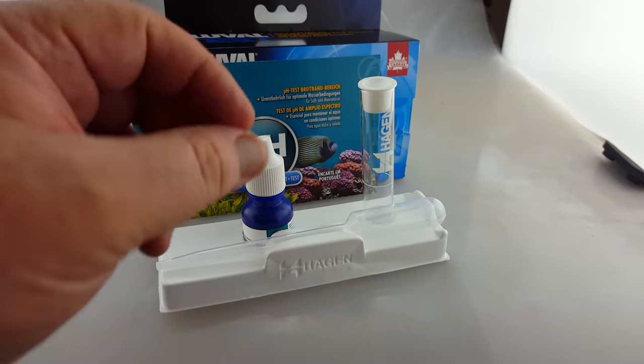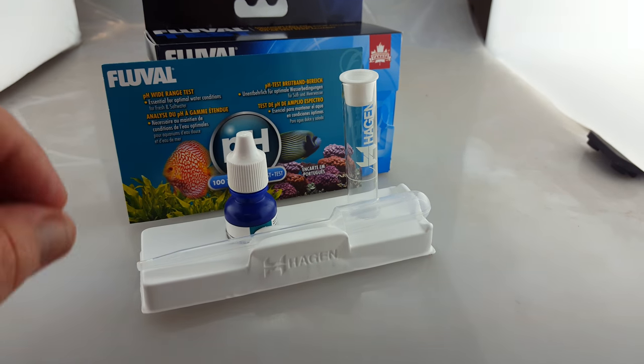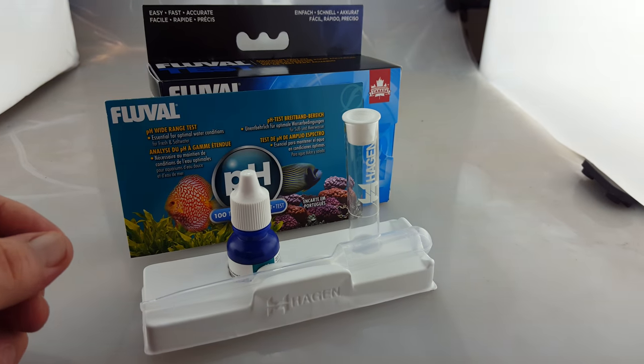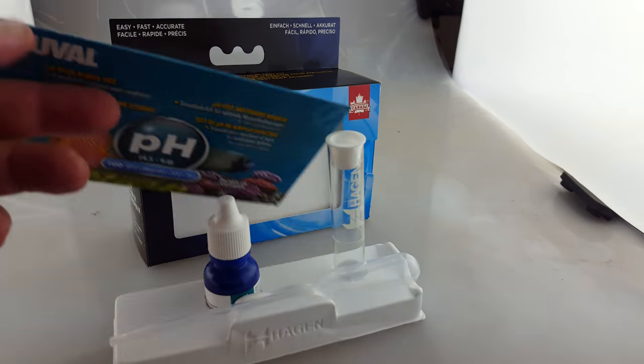A lot of the other test kits you've generally got to put the vial in the water and try and scoop out as close to 5ml and then tip out and add and keep doing that until you get it right.